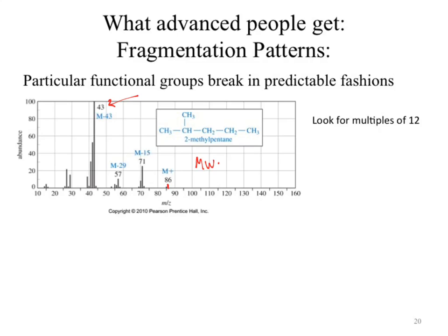So the next thing that we could go through and do, we have a molecular weight of 86. What does that mean? Not bromine yet. No nitrogen, because 86 is even. Why no bromine? Because it's 79 or 81, and you would be left with 5 or 7 hydrogens. Fair answer. I didn't come to that conclusion.